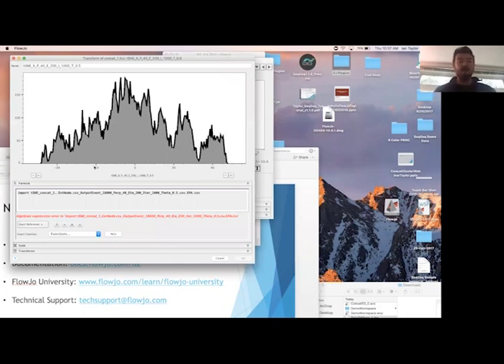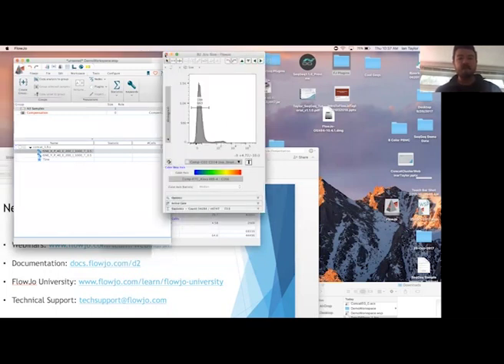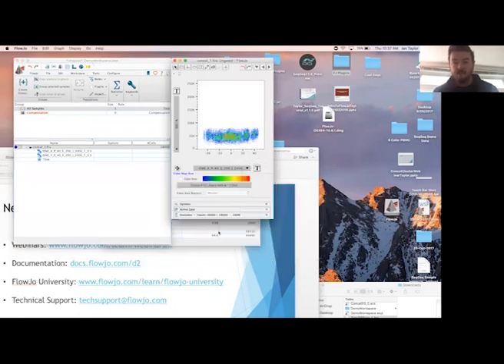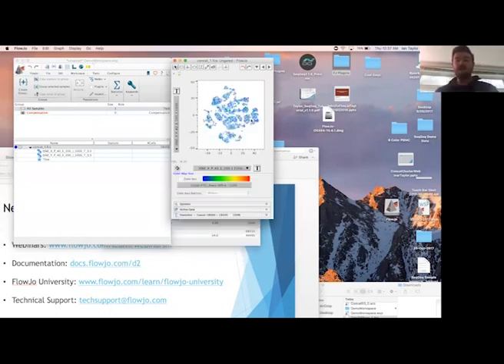Another thing you'll notice right off the bat is that we're looking at a linear scale, which is as expected. So the t-SNE mapping is done into a linear space, and it should do its best to separate out different populations in an unbiased fashion, and that's really important. So let's close down some of these other graph windows, and we'll investigate the t-SNE just a little bit as kind of the final hurrah here. So t-SNE X, t-SNE Y. And so this actually arrived at really nicely delineated islands where we see different potential biological functions occurring.